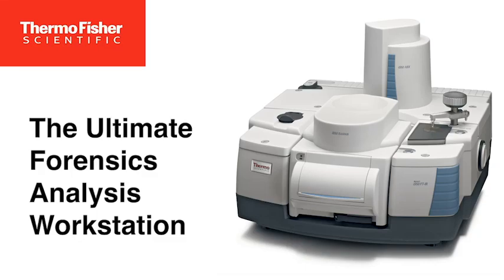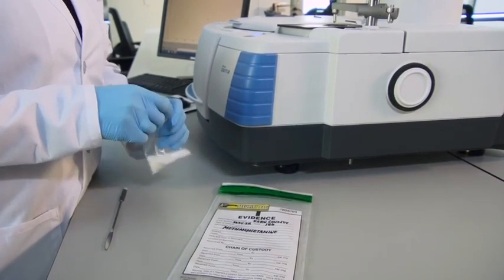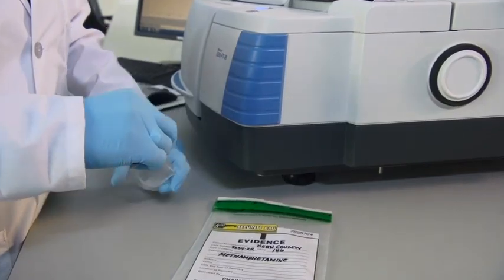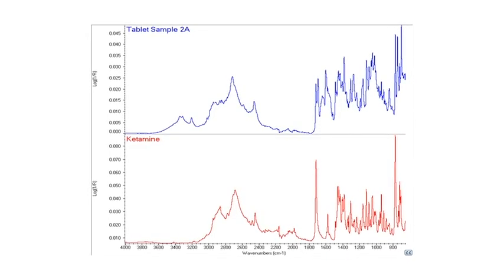International drug enforcement agencies, police departments, and customs laboratories rely on FTIR spectroscopy to quickly identify illegal drugs, crime scene evidence, banned materials, and counterfeit goods.